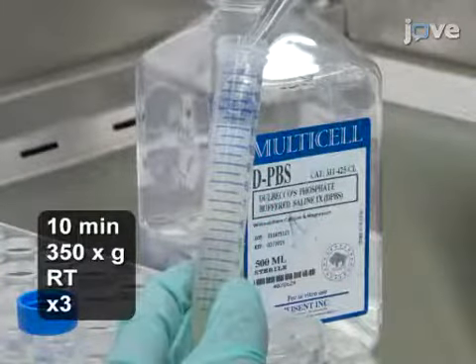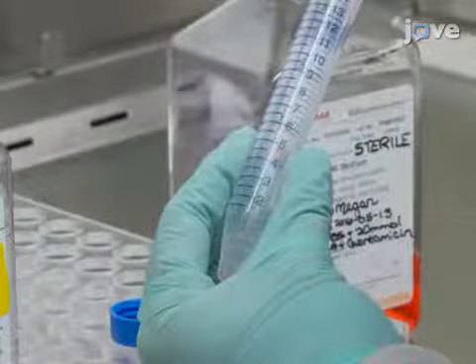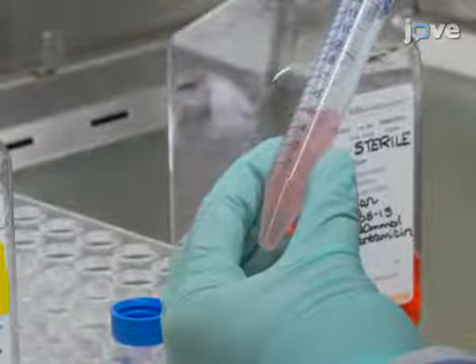Wash the isolated PBMCs three times in PBS, re-suspending the cells in 3 to 7 milliliters of medium after the third centrifugation.